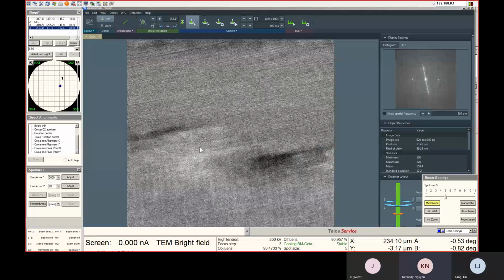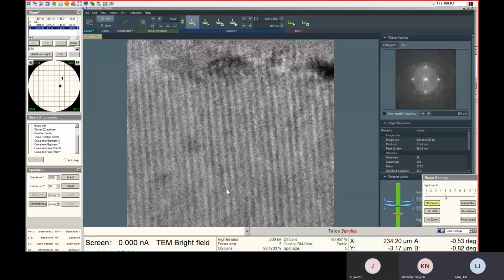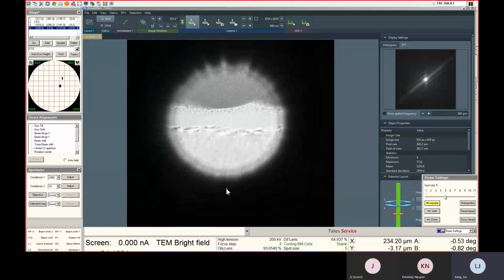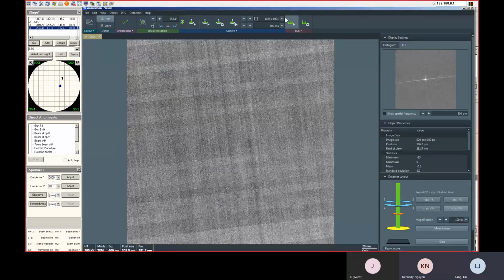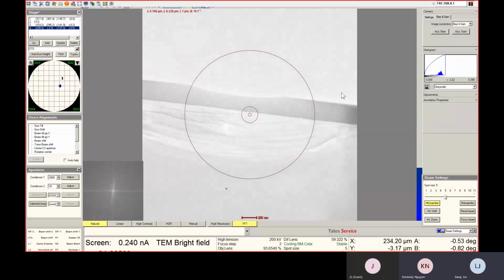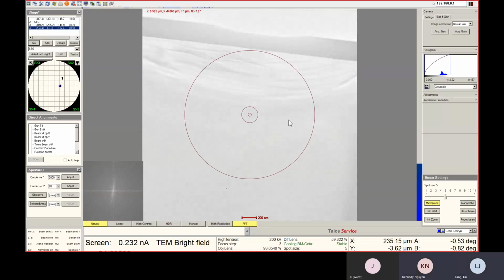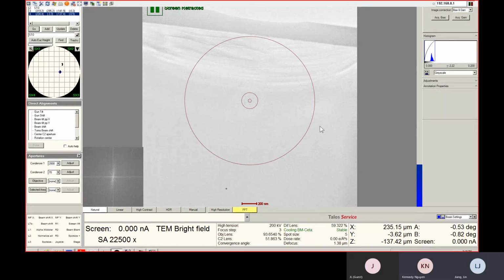And then we could take a picture on our sample down here. Yeah, this is not at zone axis. Probably we need to go down to zone axis, because the sample is not flat here. You see, here you have curtaining. You really need to move up here. Okay. And then zoom in.